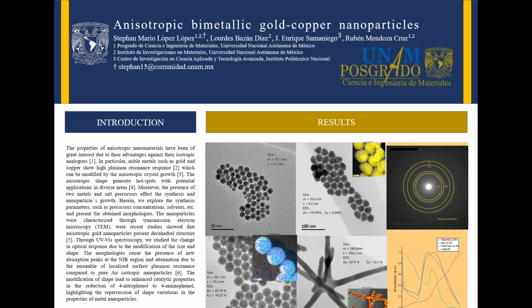The morphologies shown in this work will be compared not just by morphology or plasmon resonance response, but we will also compare the catalytic activity to reduce 4-nitrophenol to 4-aminophenol. The objective of this work is to modify synthesis parameters to obtain different shapes of gold-copper nanoparticles.